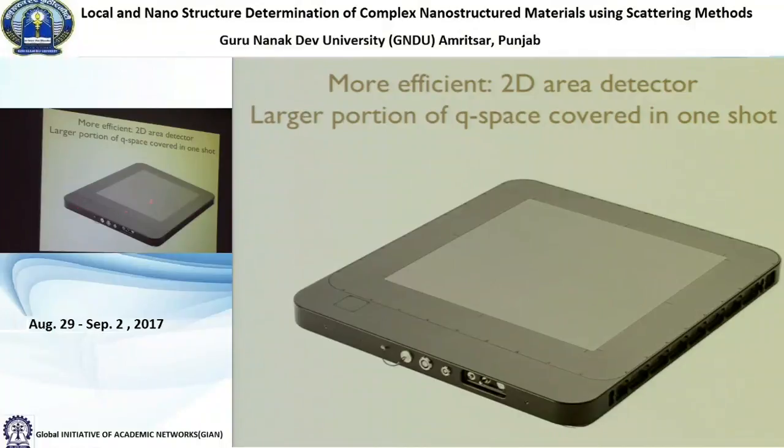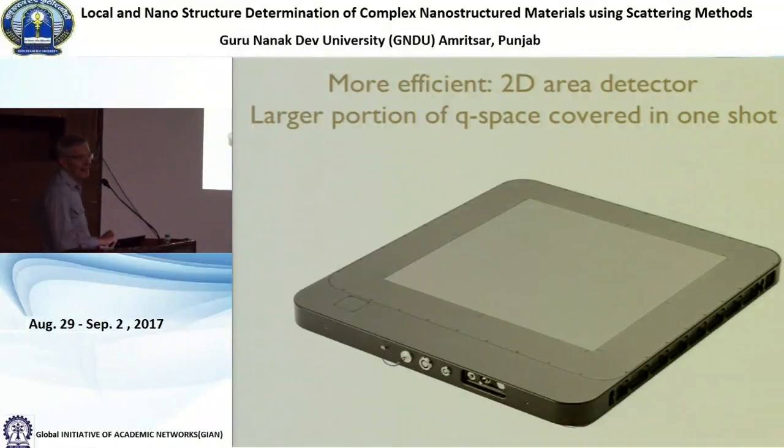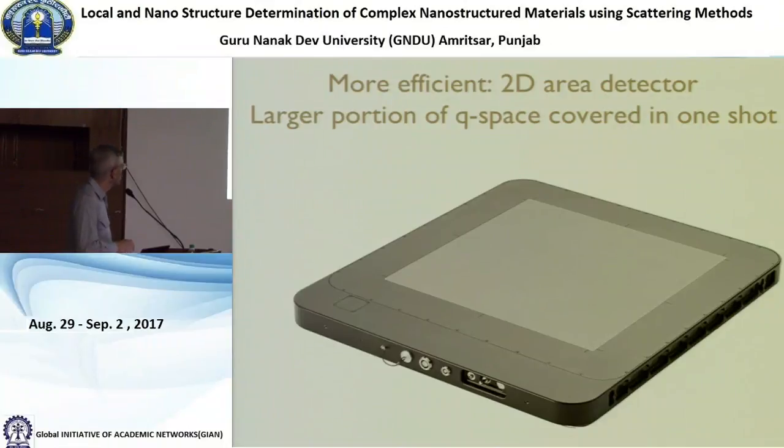And the quality of the data we're getting from those Pilatus detectors is just amazing. Just as we've had a revolution in the sensitivity that I told you about, we're going to have another revolution, almost the same, in sensitivity when we get these new detectors.